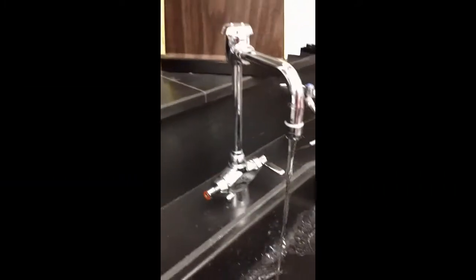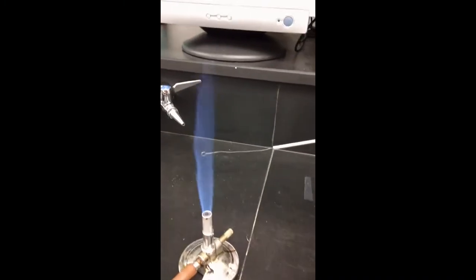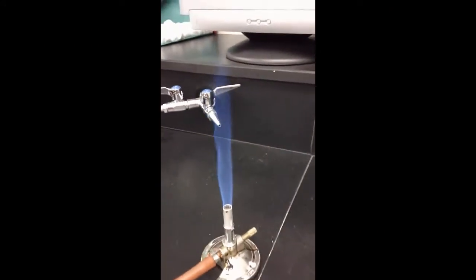Every once in a while you want to wash it off, make sure that we're clean. So I'm just cleaning. This is just cleaning. Okay? So I'm going to stick it back in the ZN. Try it again.